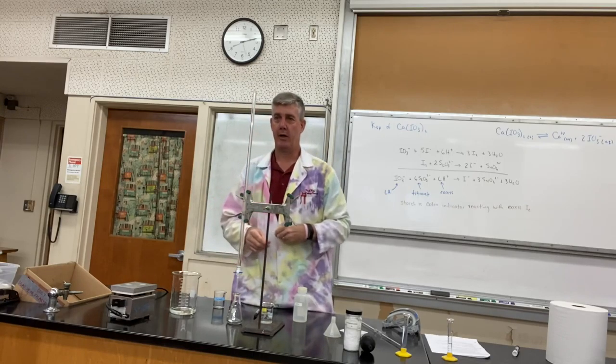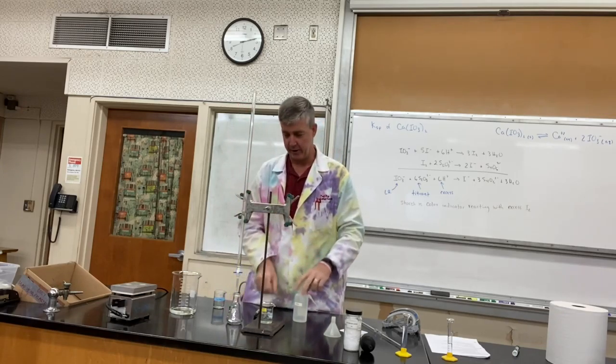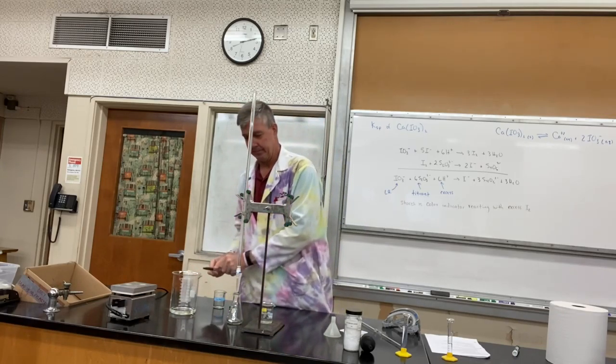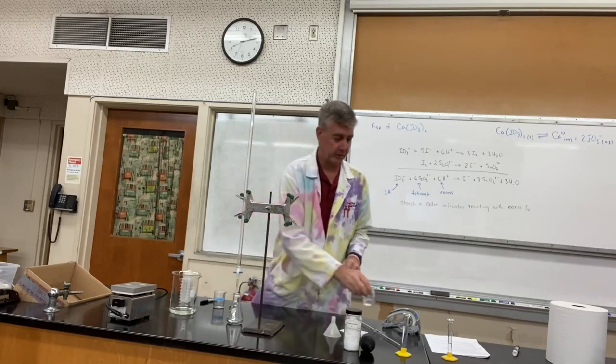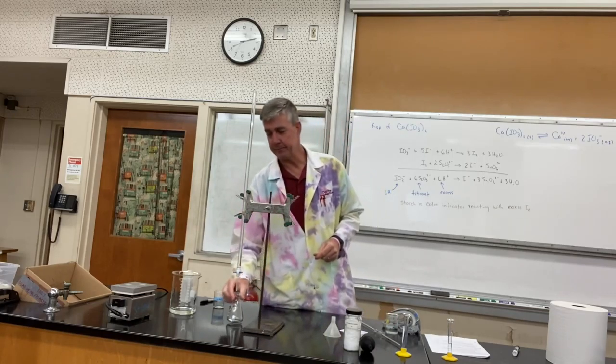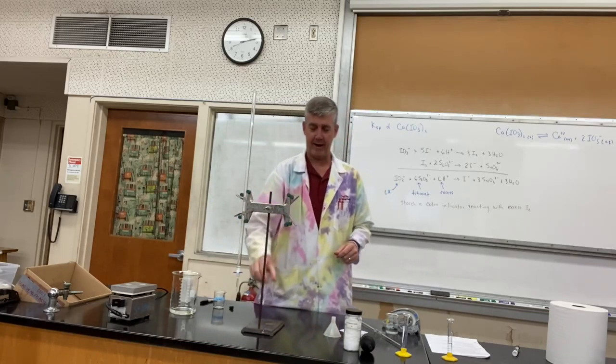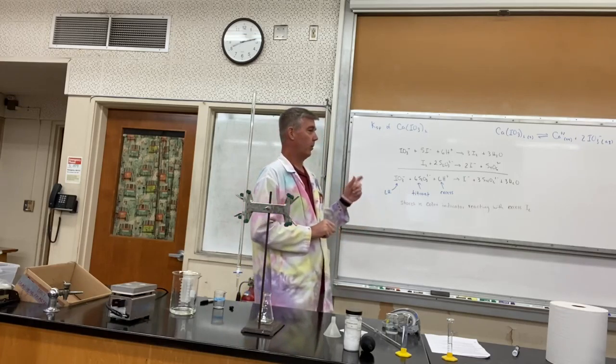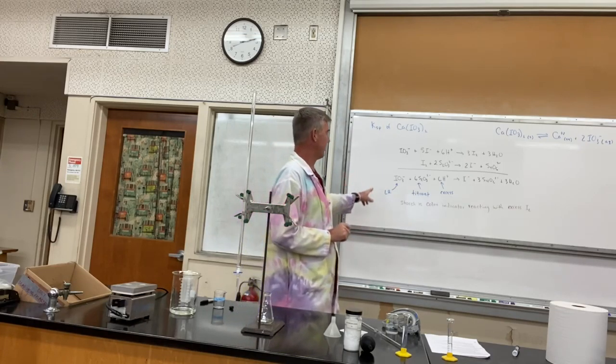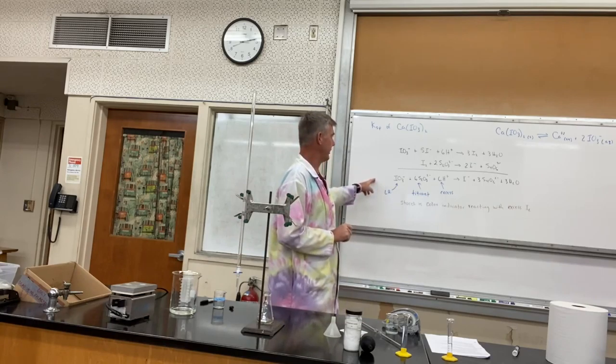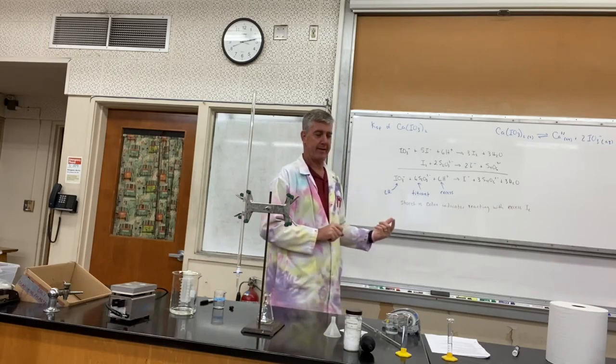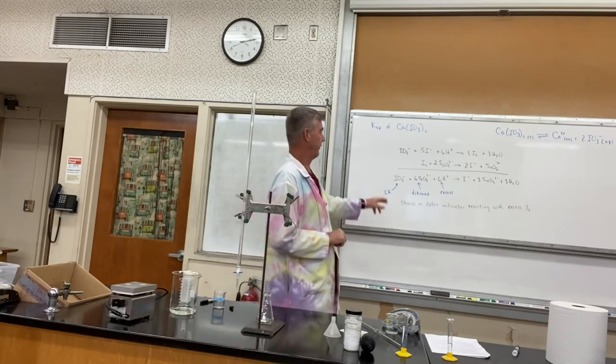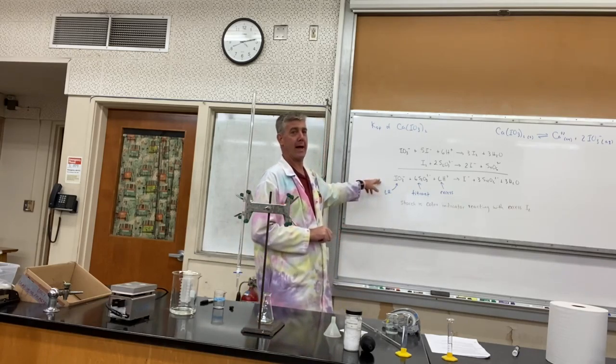Now I'm going to cheat. I'm just using DI water, which is why I don't have my goggles on, but I just wanted to show you the process. When you fill your burette, you don't want to fill it or try to go exactly to the zero line. That would create bias in your readings. Just go somewhere between zero and five mils.